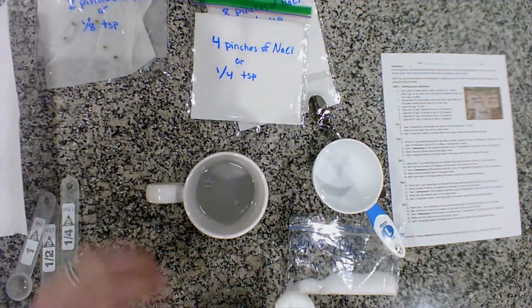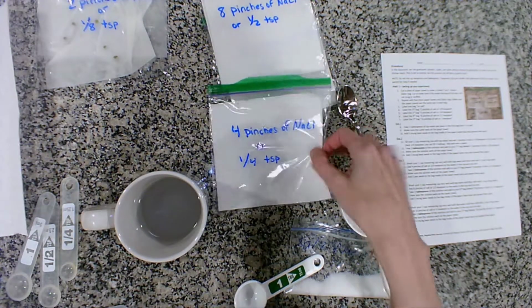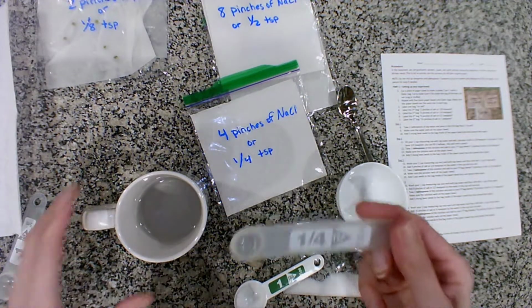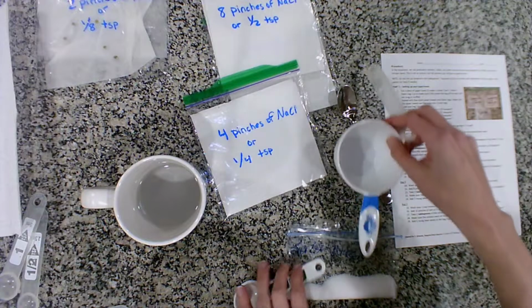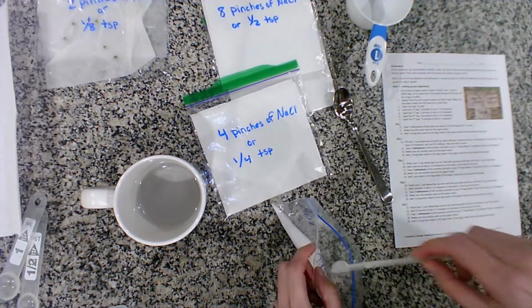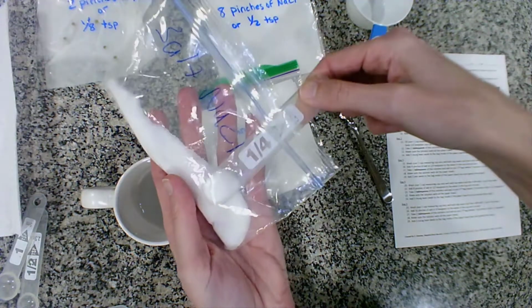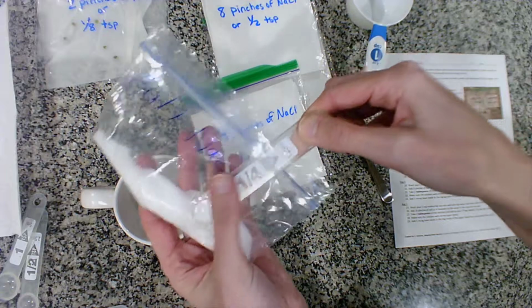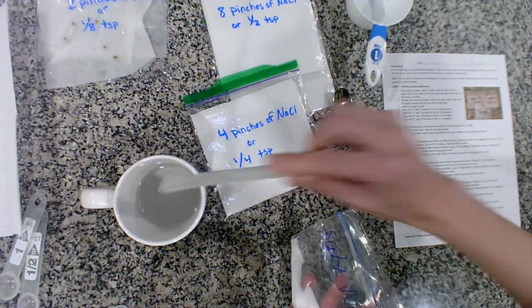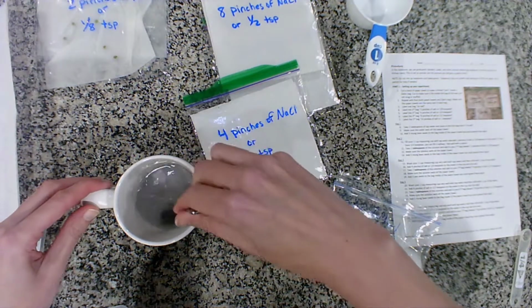Okay, new cup here. Next bag says 4 pinches of NaCl or 1/4 teaspoon. I'm going to go ahead and use my 1/4 teaspoon. If you have it, I do highly recommend that you use these just because it's more accurate. But if you don't, that's okay. So I'm going to go ahead and get 1/4 teaspoon, and it needs to just be kind of level there. Go ahead and add that in. Stir it.